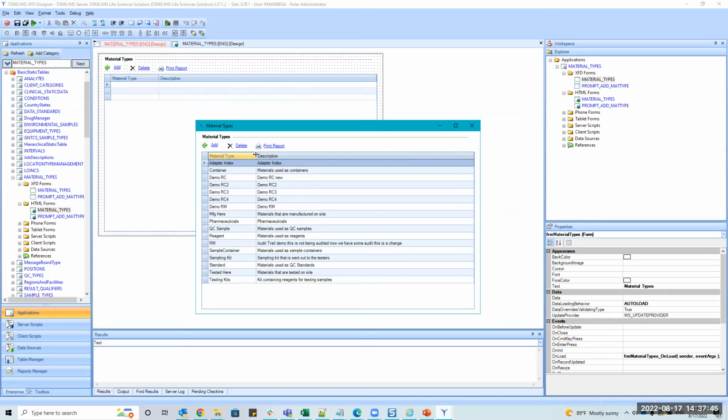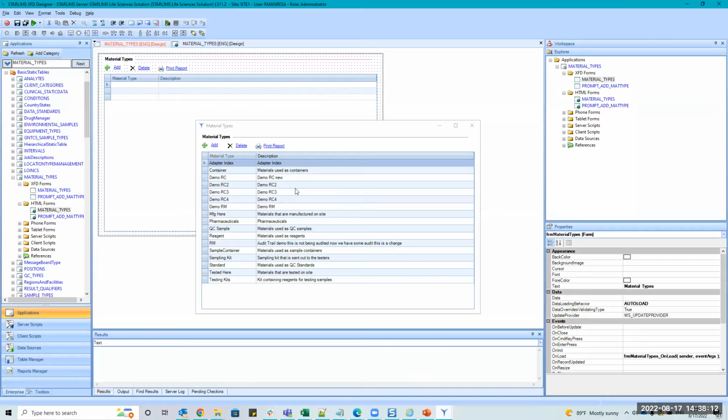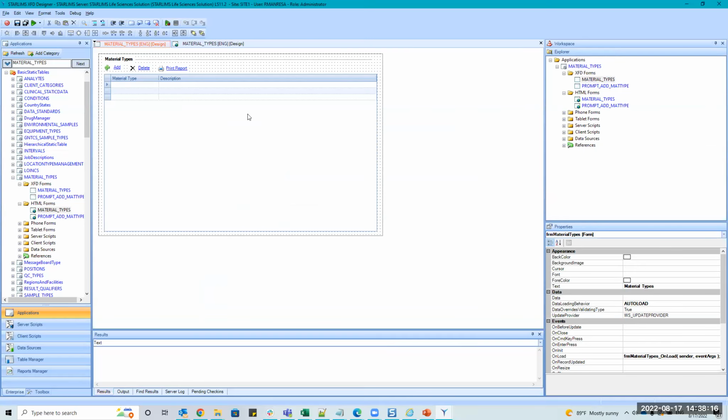You needed to run it in Internet Explorer, the only browser that supported it, and a lot of client installs needed to happen. Right now it's pretty light. It runs on Chrome and Edge. The only install you really need is this bridge, and only if you're doing developer work. You don't even need the bridge if you're just a user, for the most part. There are exceptions, but the PowerPoint is going to get into this and how this became.